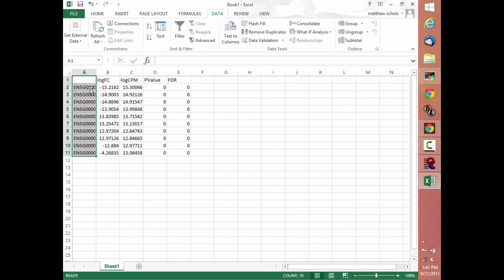One of the adages that I was always fond of, and I use a lot as a statement, is that bioinformatics as a field came into existence when data became too large for an Excel spreadsheet. Biologists are really good at Excel.